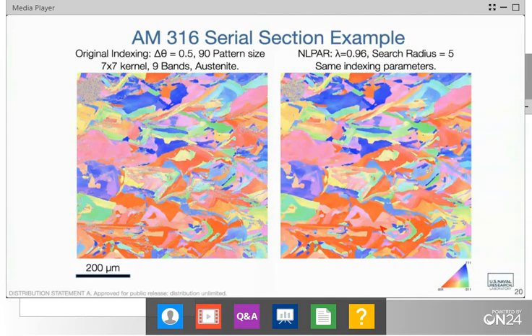One of the things we'd really like to do is start running some simulations using things like dictionaries to make sure that that sharpening is real. We tend to think that it is because that is more similar to what we see within TEM investigations and those types of things. And so we think it's actually a fairly accurate representation.